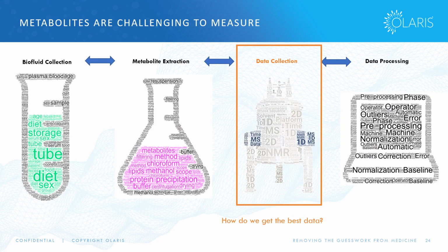Then we go to data collection. So how do we get the best data from our NMR?